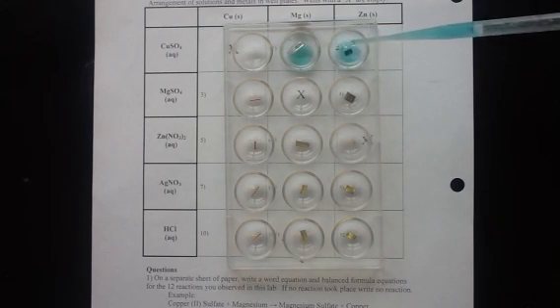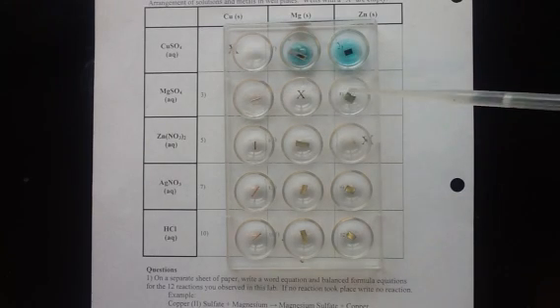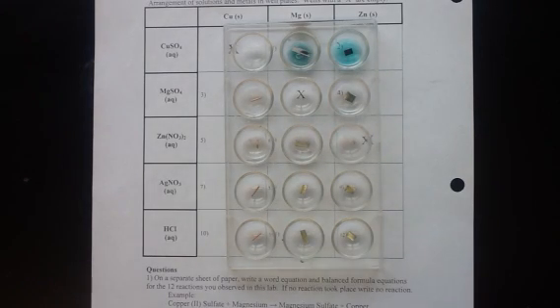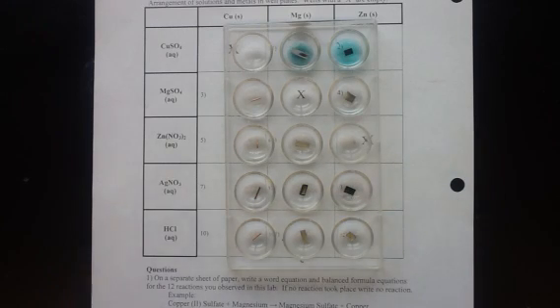In this first row I'm mixing copper sulfate with the magnesium and zinc metals. I skipped that first box because that would be mixing copper sulfate with copper and no reaction would occur when you're mixing copper with itself. The second row here I'm doing magnesium sulfate, mixing it with copper and then with zinc. Our third row I'll need to add zinc nitrate, the fourth row will be silver nitrate, and then our bottom row is hydrochloric acid.